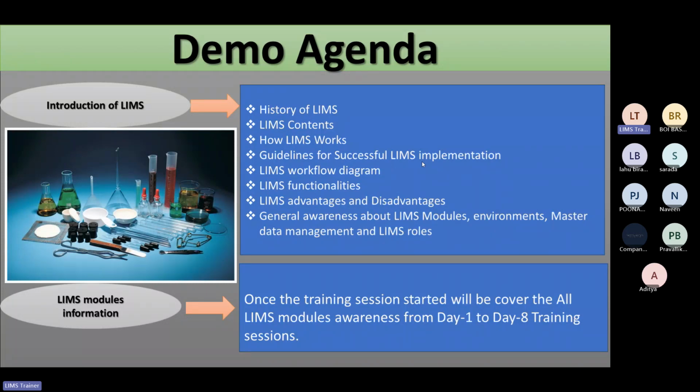Many of the laboratories which are working in manual mode want to shift from manual to auto mode. In such a scenario, knowledge of LIMS implementation will be a great benefit for a candidate, who can grab that opportunity. Then the LIMS workflow, how the workflow actually happens in the software. Then the different functionalities available with the software, some advantages and disadvantages, and general awareness about the different modules available.